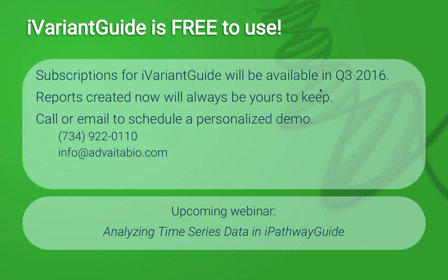What is the source of clinical significance? Only ClinVar? That's right. At this point, it's only ClinVar that we're using. However, we offer links out to those other databases, so that you get more complete information that way.